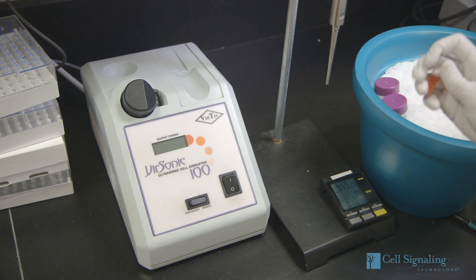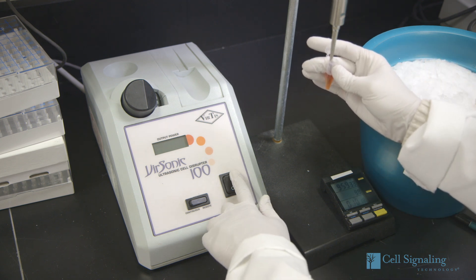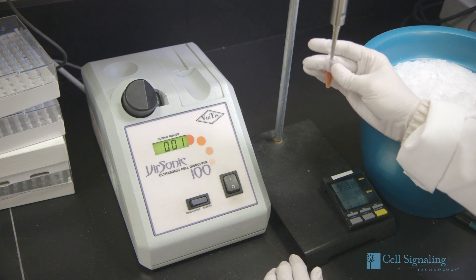Now, sonicate the cell extract for 10–15 seconds to complete cell lysis and to shear nuclear chromatin. This also reduces the sample's viscosity and is especially important for detection of membrane-bound and nuclear proteins.